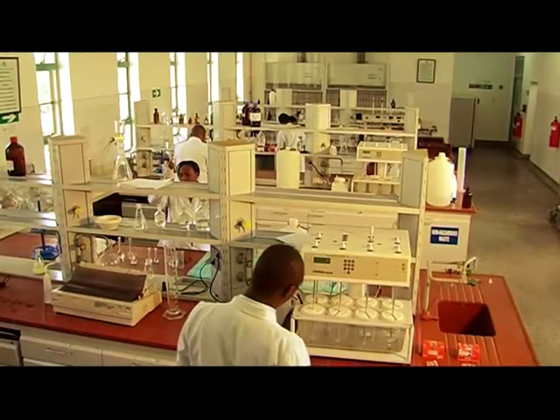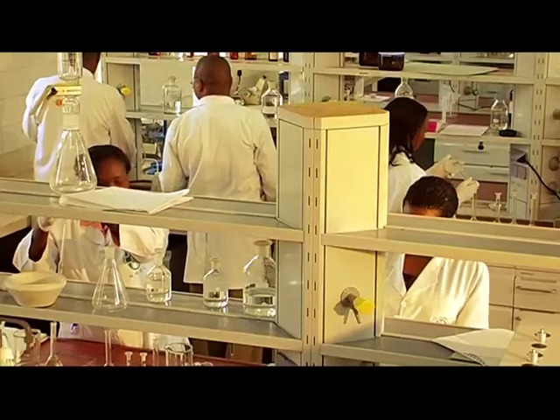Notwithstanding, the lab boasts 4 different departments manned by well-trained, qualified and experienced personnel. The workforce is divided into 4 main departments or units. That is the wet chemistry unit, the biological analysis and medical devices unit, the documentation unit, and the quality assurance unit. The tests that we carry out on any products are determined by what is requested of our clients, and also by standards which have been set by international institutions.